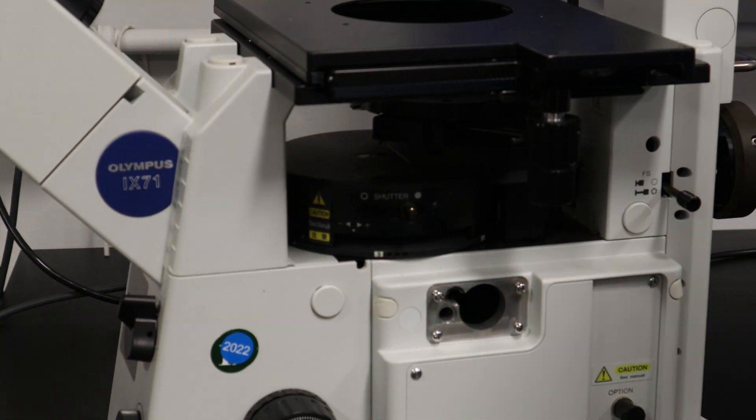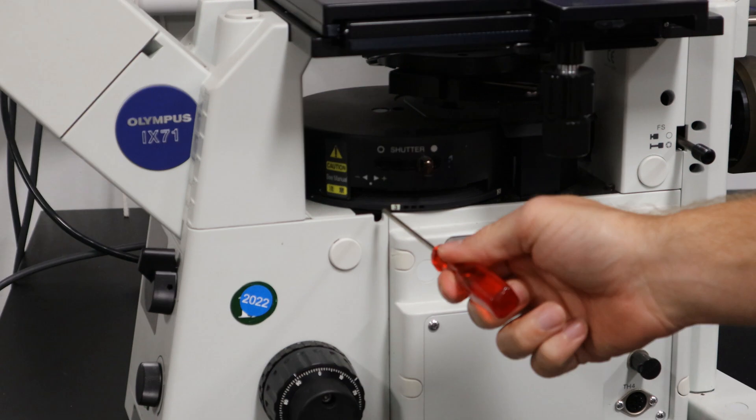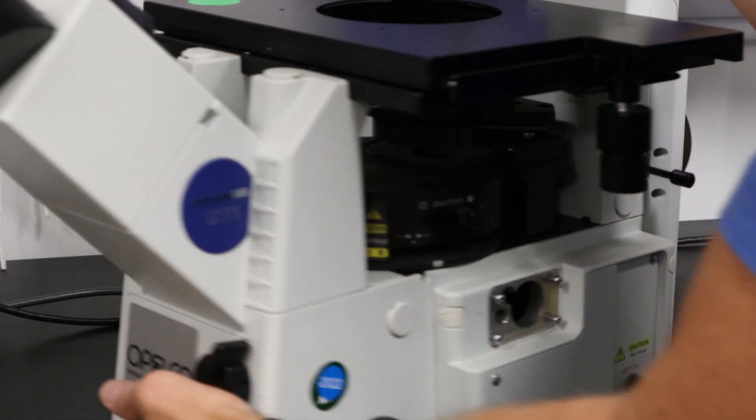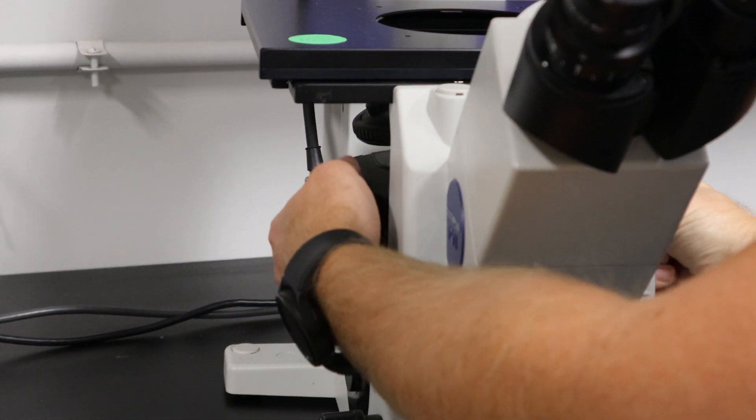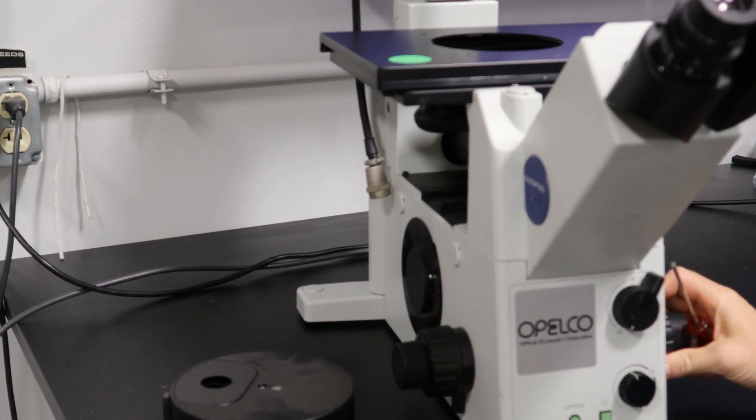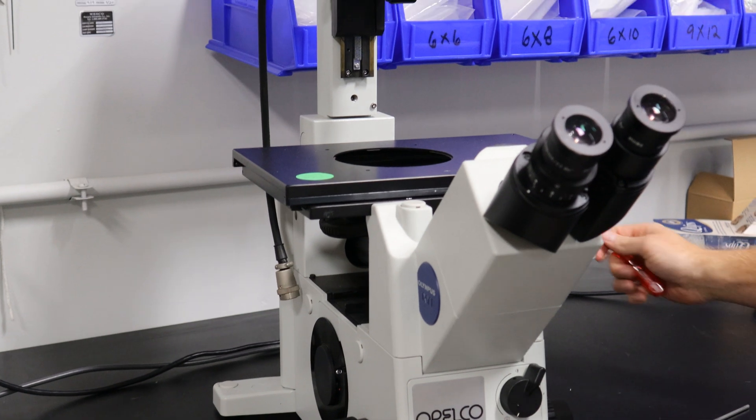First, we're going to take out the fluorescent cube turret. Right here on the right side of the system, you'll put a three millimeter Allen wrench and loosen that screw that's in there, and then this will push right out. Sometimes it'll get caught on the focus, so make sure the focus knob is all the way up and the nose piece is all the way up there.